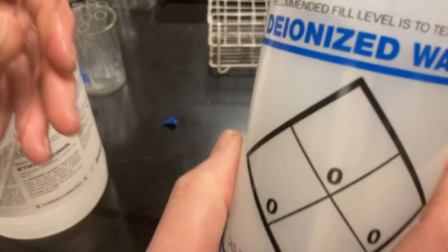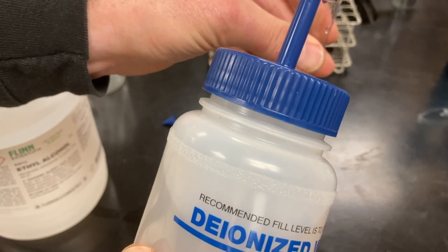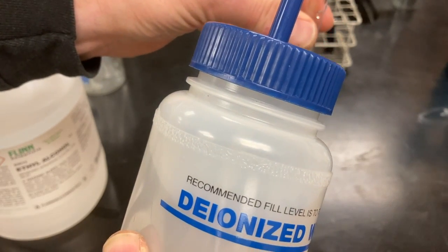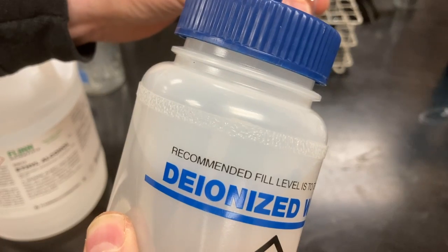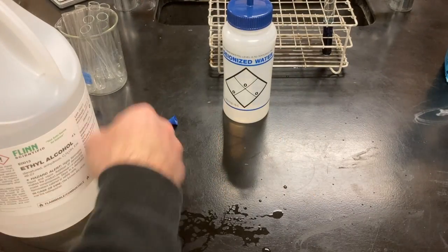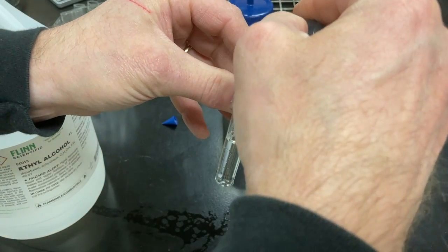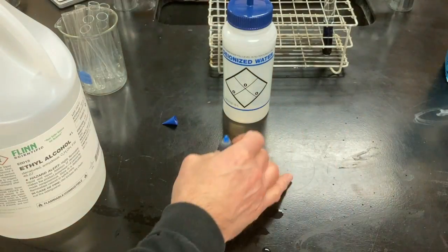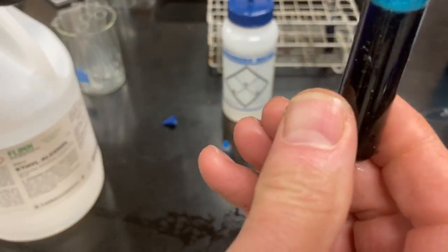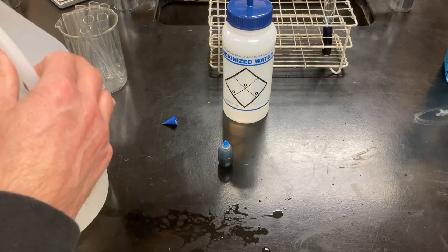I'm about to make a mixture here. I've got some water, just pure water, deionized water, and I'm putting it in a test tube. And next I'm going to take an alcohol. No, actually before I do that, I'm going to put in a little food coloring just to mark the water so that it's easier to tell where it is, because I'm mixing it together with another liquid that's also colorless like water. So I'm just coloring the water a little bit.